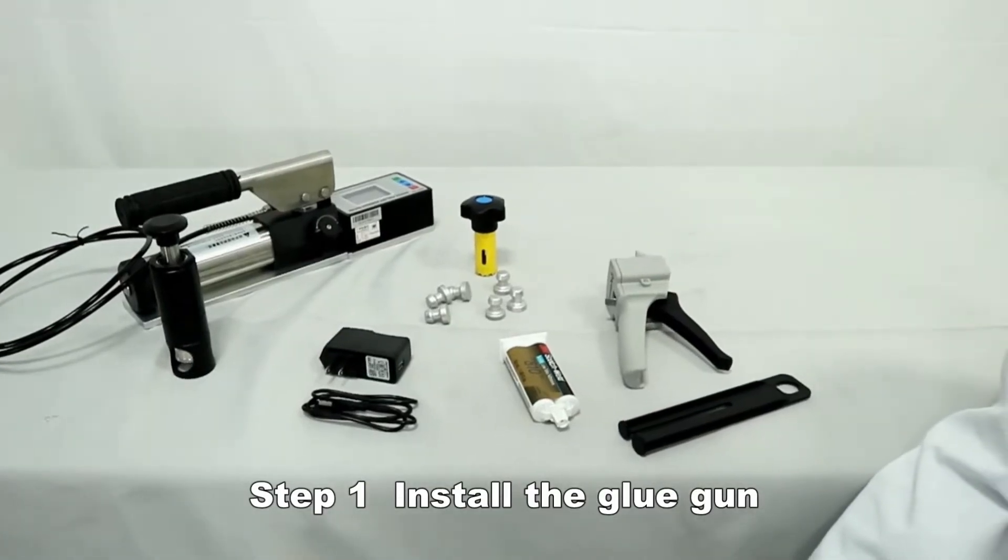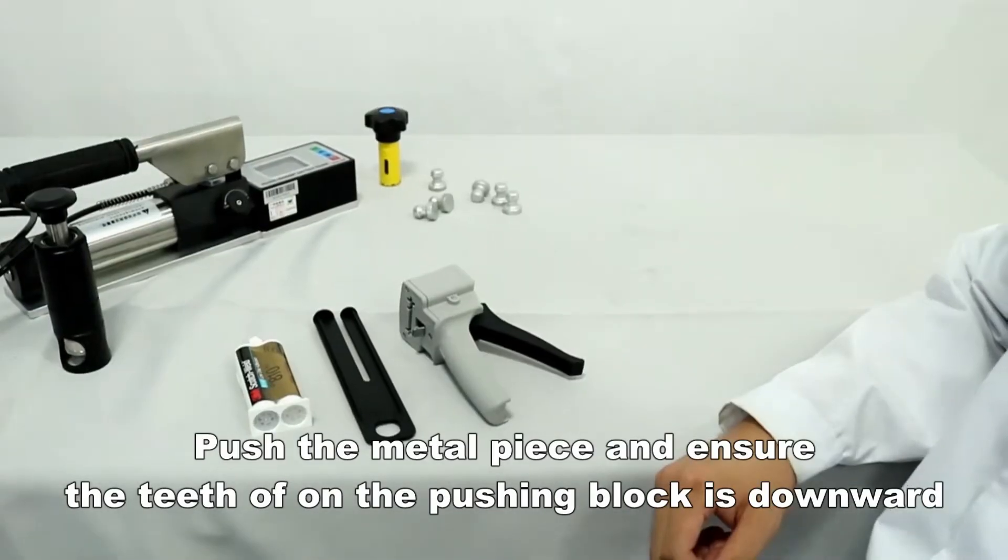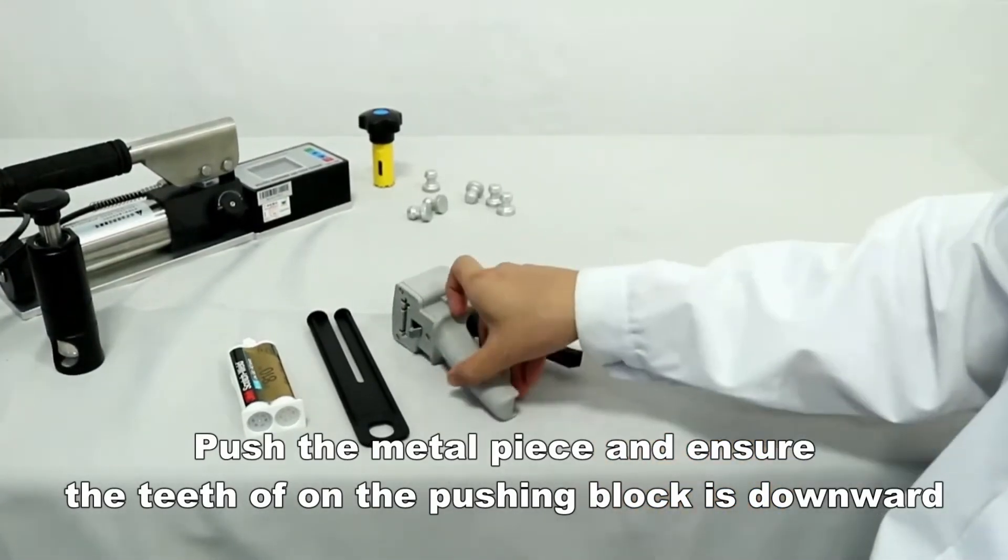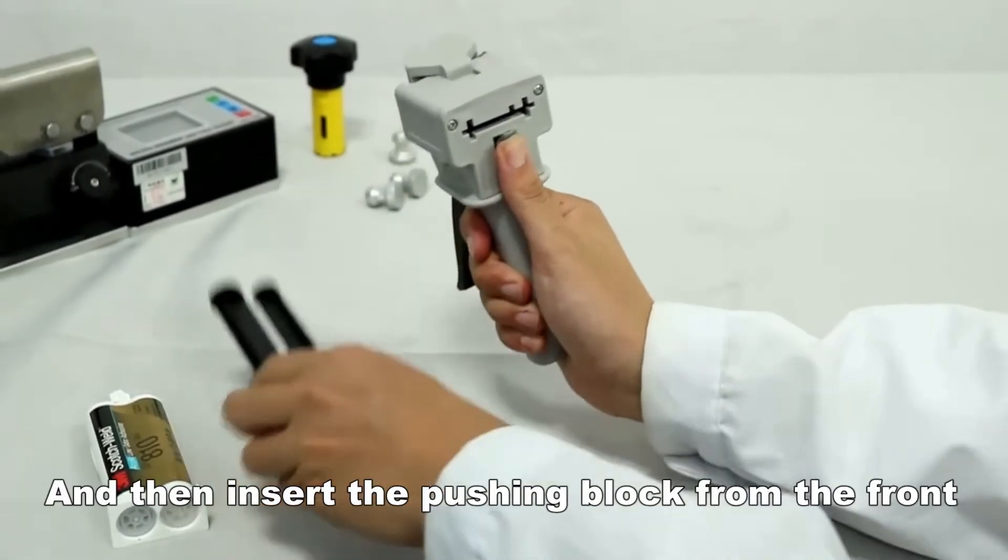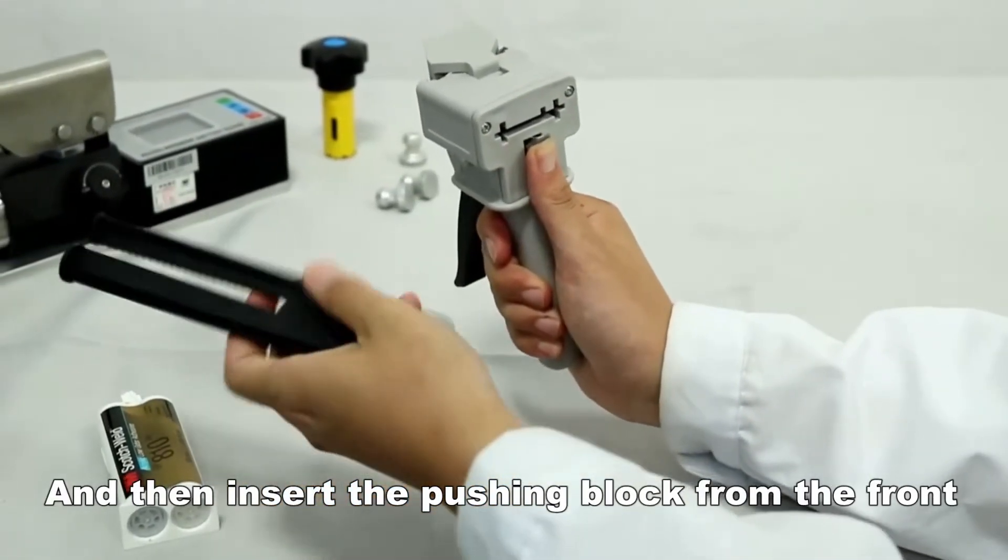Install the glue gun. Push the metal piece and ensure the teeth on the pushing block is downward. Then insert the pushing block from the front.